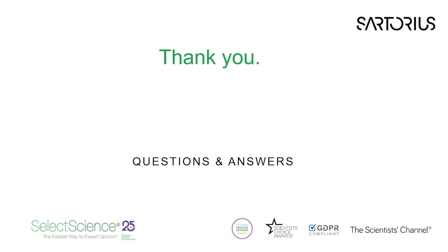Great, thanks a lot for that, Kate. And the next question I've got here for you is an attendee saying, for forward pipetting, we push to one to aspirate, but when we dispense, should we be pushing to one or two? So just to go through this again, you first of all push to one to aspirate, just to step one to aspirate. And then obviously you lift it up back to zero. And then for the dispense, you push to one, and then to get rid of the final bit, down to two. So you push down to one for aspirate.